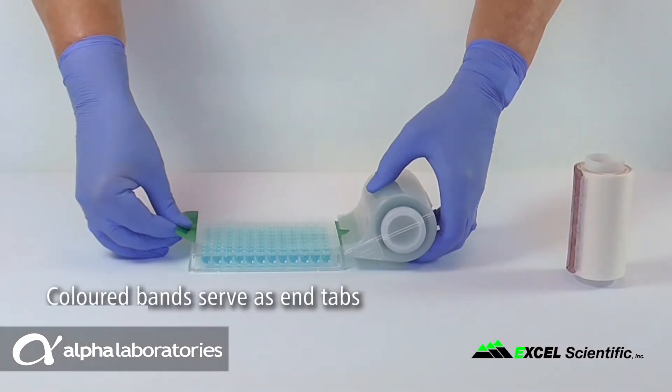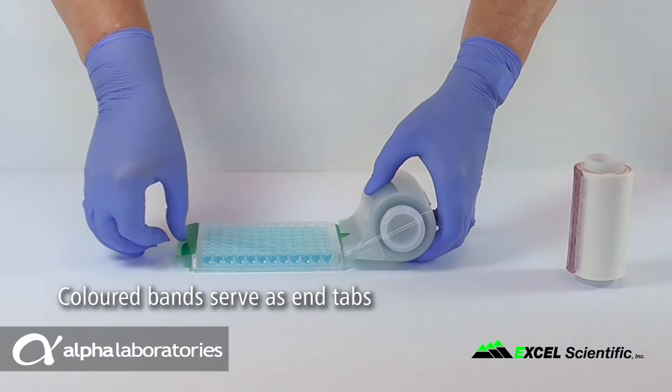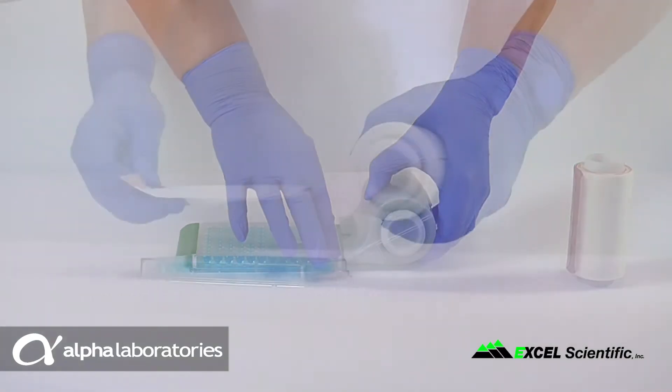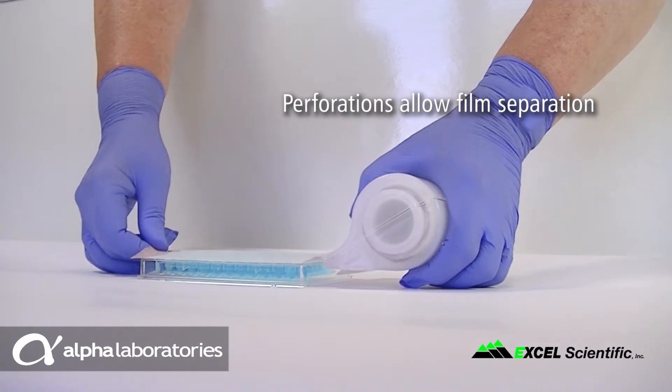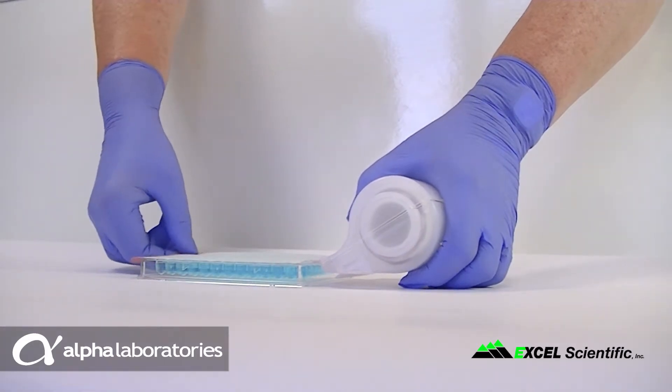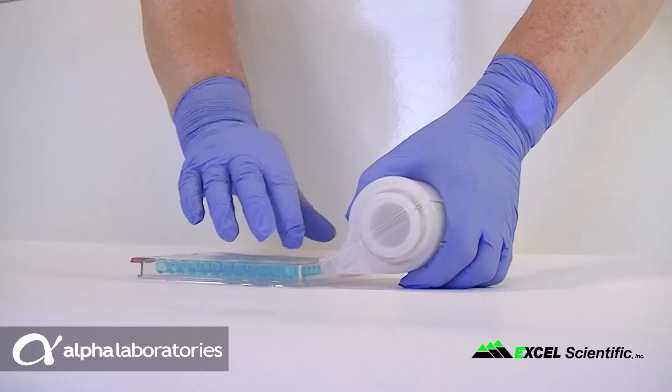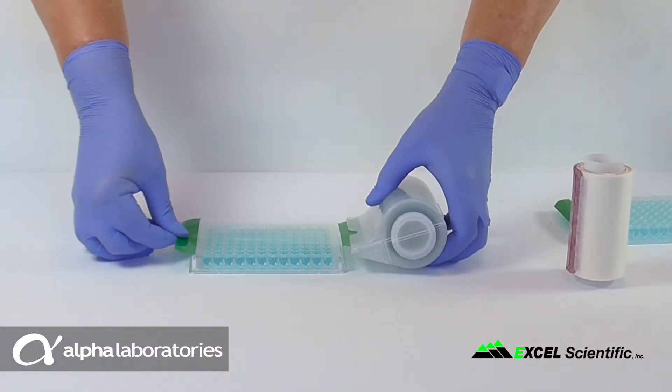The colored bands serve as end tabs for positioning the films on the microplates. They have perforations that allow the films to be separated when applied. They also provide an easy visual marker between each sheet so that the next film is not pulled out from the dispenser prematurely.